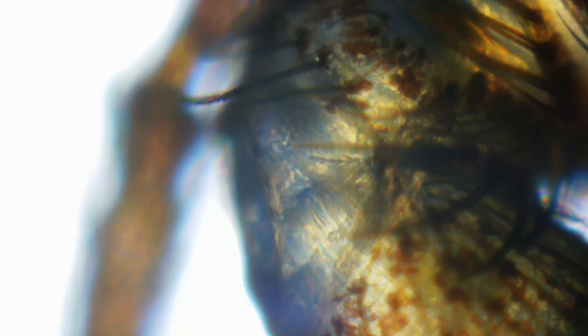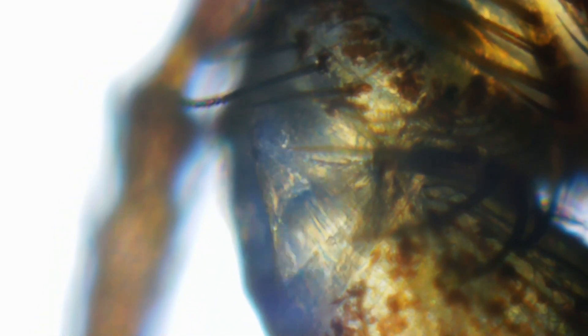A miniature predator in a vast, hidden world that is always there, just beyond our notice. The American house spider is a reminder that even in the most overlooked places, there is life. Complex. Fascinating. Beautiful.